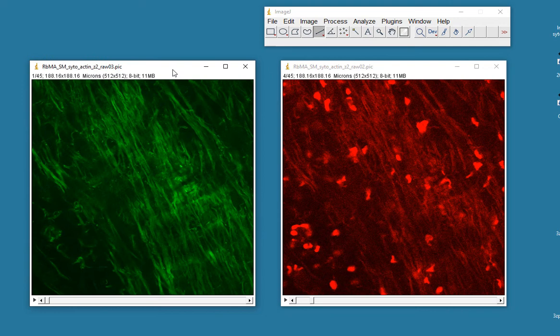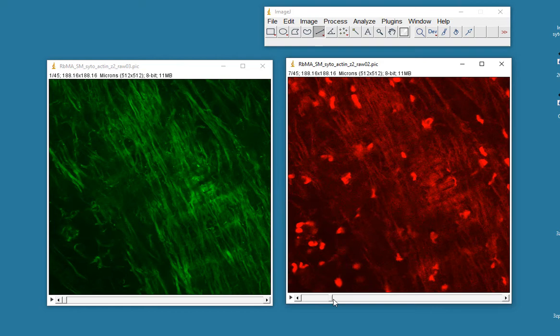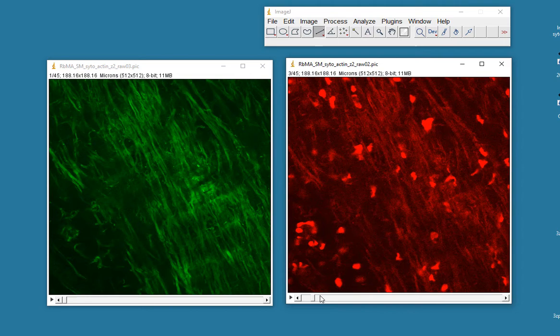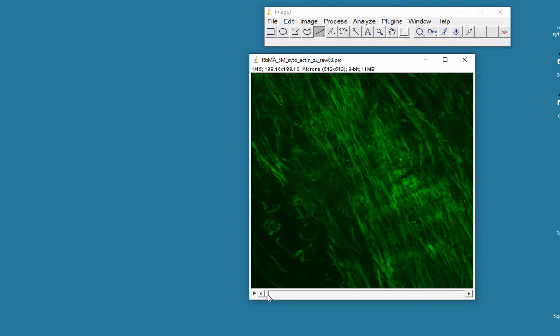Okay, here I've got two datasets. These are datasets of a piece of blood vessel. This dataset has the nuclei of what look like adventitial cells on the outside of the vessel. There's some staining here which is bled through in the channel, but really we use this channel mainly for the nuclei, and I don't really want to look at that for the moment, so let me just take it out of your view.